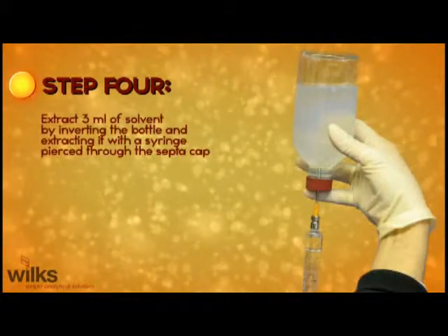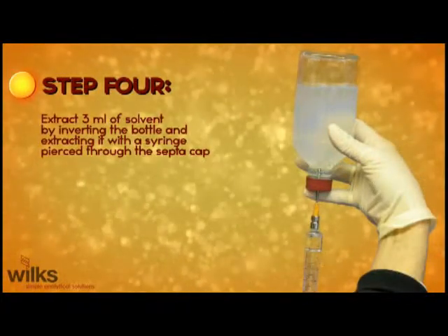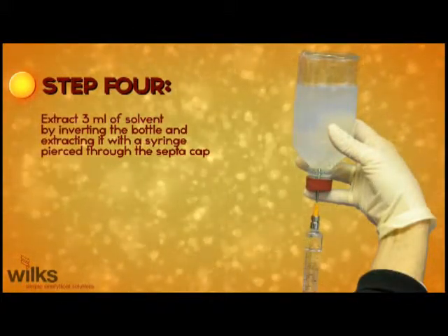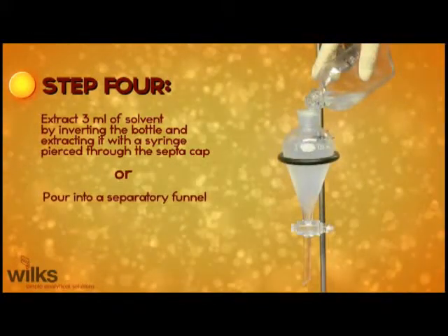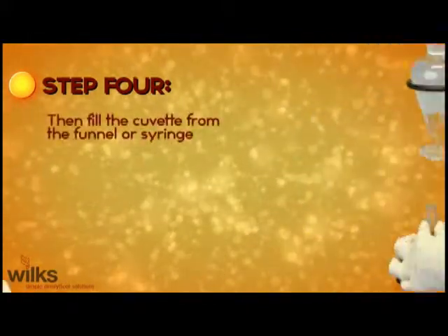Step 4: Extract three milliliters of solvent either by inverting the bottle and extracting it with a syringe pierced through the septa cap, or pour into a separatory funnel. Fill the cuvette from the funnel or syringe.